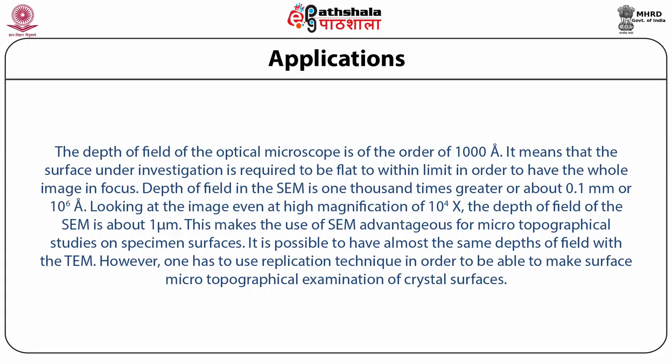Looking at the image, even at a high magnification of 10^4 x, the depth of field of the SEM is about 1 micrometer. This makes the use of SEM advantageous for microtopographical studies on specimen surfaces. It is possible to have almost the same depth of field with the TEM, that is transmission electron microscopy. However, one has to use the replication technique in order to be able to make a surface microtopographical examination of crystal surfaces.